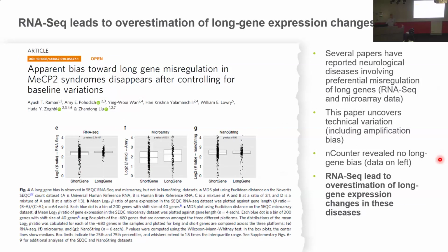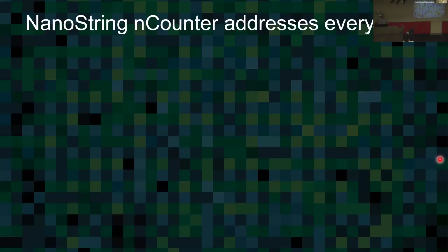It's mostly 2-step RT-PCR. So I think single step is probably worse, because you've got to do everything together. You can't optimize it separately. Well, things have come a long way in 30 years, but not that far. There's still a big problem with this. So it's not to say it doesn't work. I think the point here is you have to work hard to make sure that it is working, and then validate it like hell, and then by all means, use it. I'm just trying to give you an alternative that takes a lot of this noise away, right?